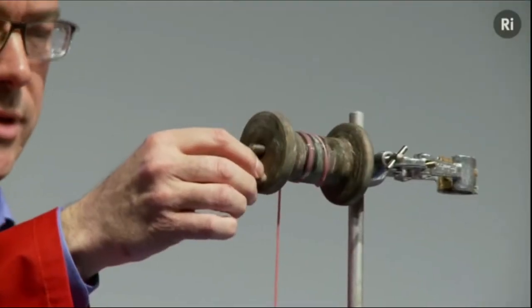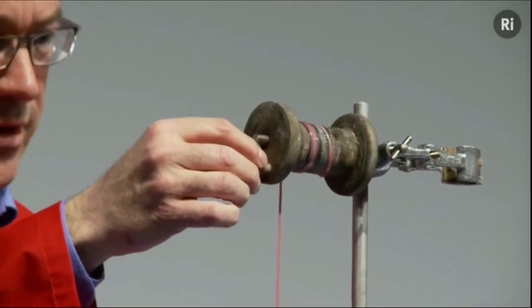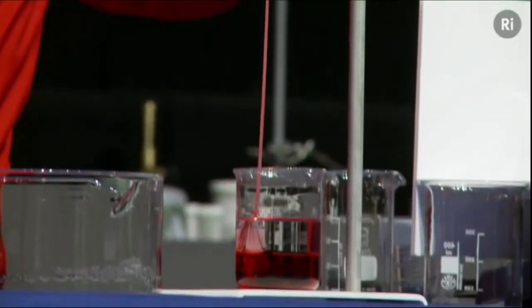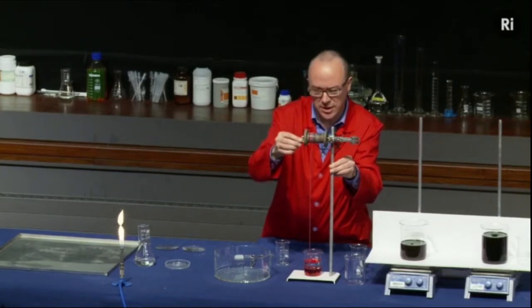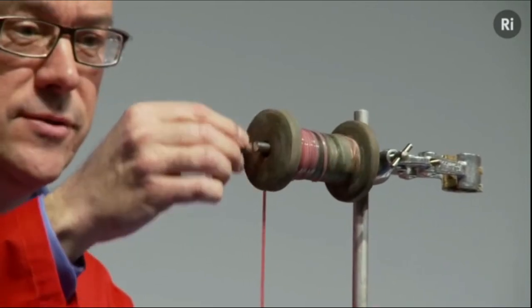as I wind, I'm pulling up this material, and it allows the two liquids to meet again, and it forms more of this material. And this substance that's being formed is actually nylon. So we're making nylon as I speak. And if I'm careful, I'd be able to just keep on turning this and making this long thread of nylon, at least until we run out of solutions.